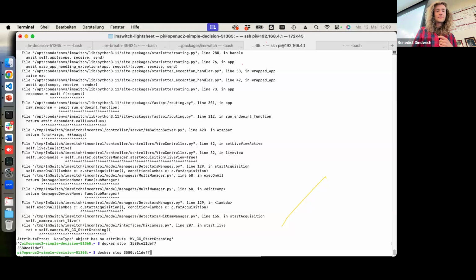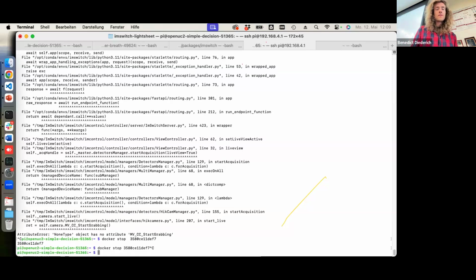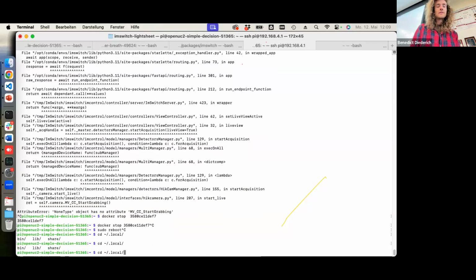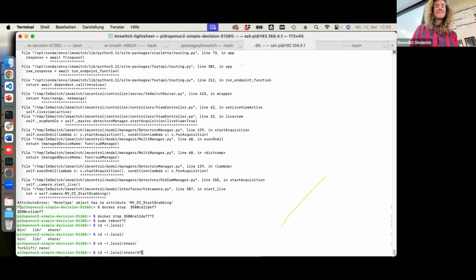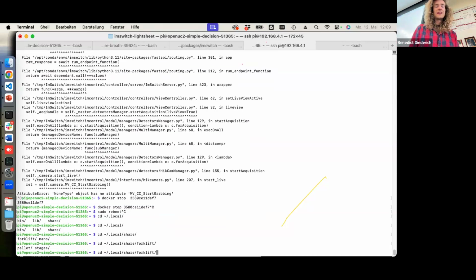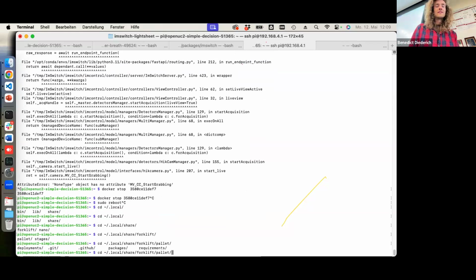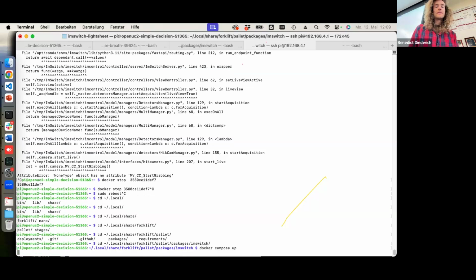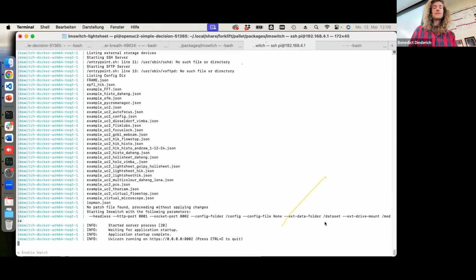I think instead of the long text name, you should be able to use the name of the container. Maybe, but the container's name is also quite long, isn't it? Maybe it is. If you do Docker PS, that should show. I don't recommend doing it this way. That sounds like data analysis. In addition to that, having a restart option would be very nice. The restart option is kind of Docker, although there are physical aspects to it.